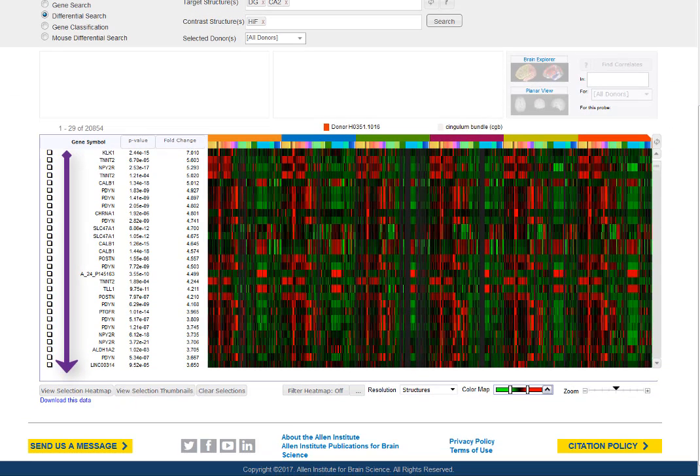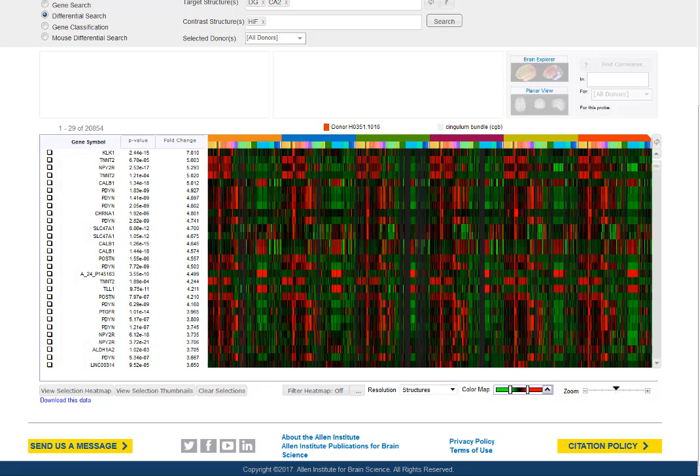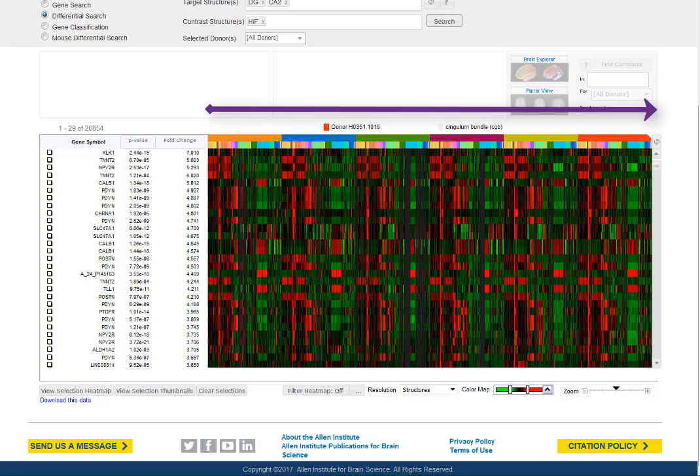The vertical axis displays the gene or the probe information, and the horizontal axis has two column headers, both color-coded. The top row indicates the donor, six in this heat map.